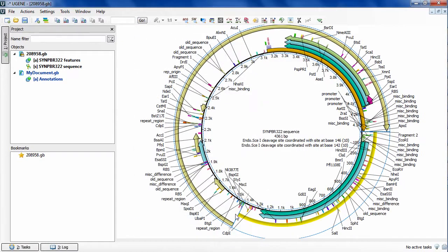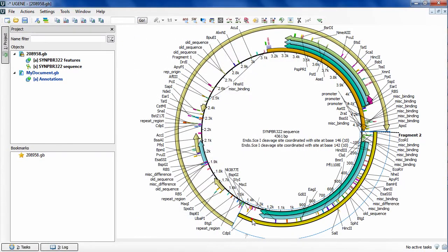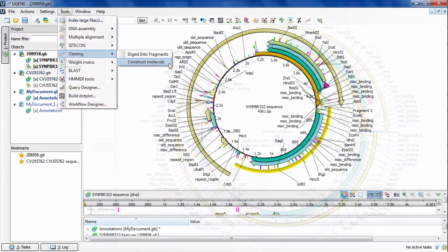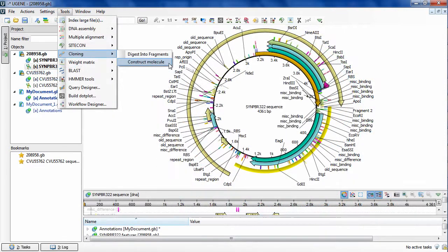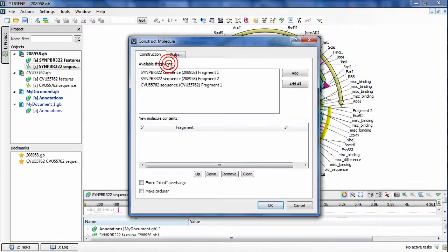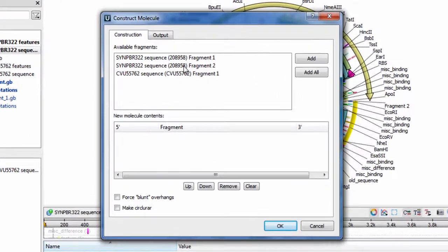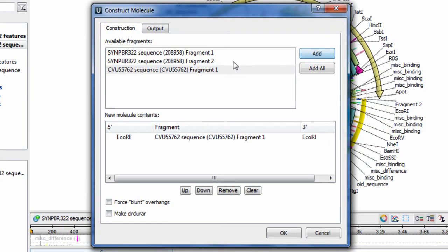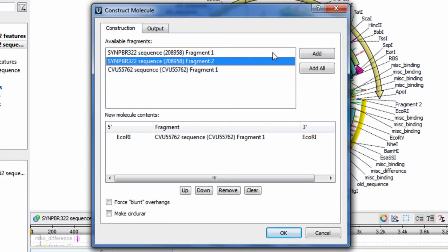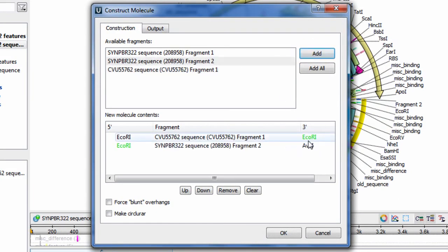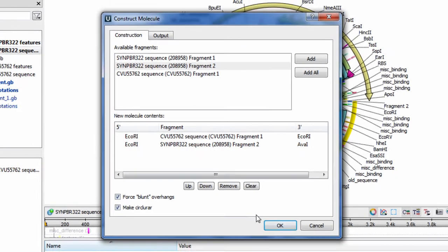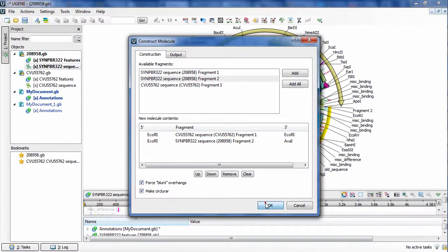When the fragments are found, you can construct a new molecule using them and the Construct Molecule tool. The results are saved as annotations and automatically displayed on your screen.